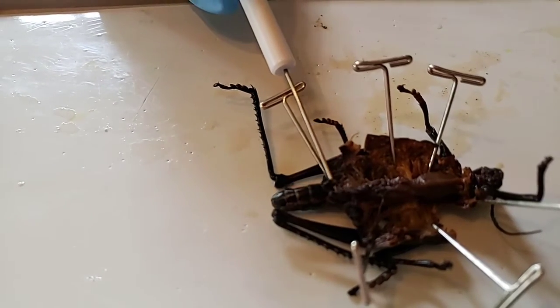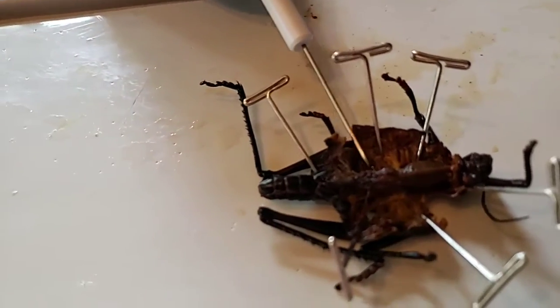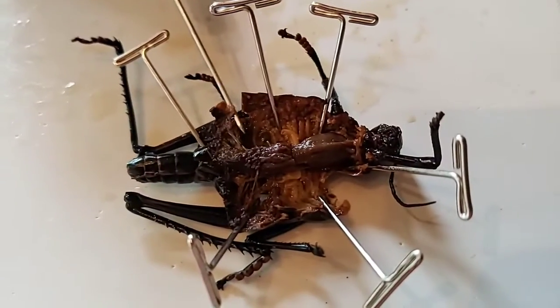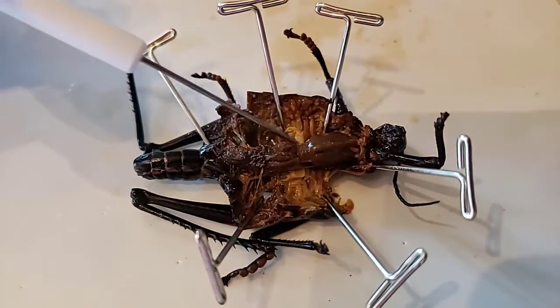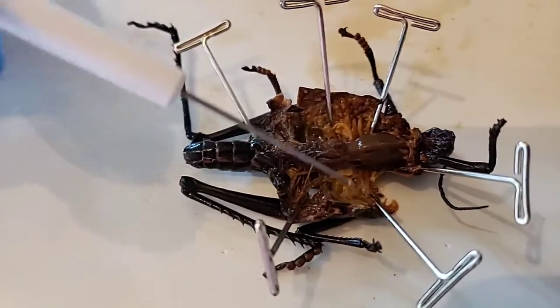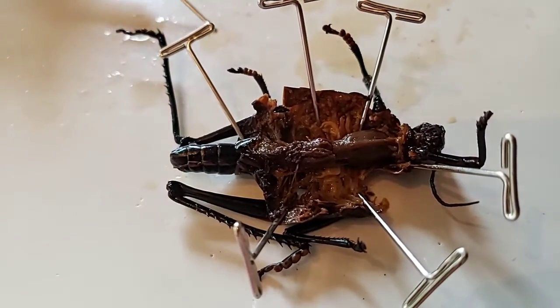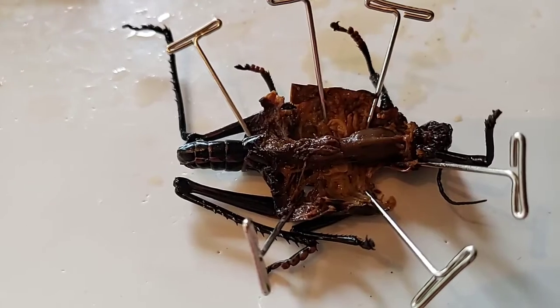You're going to see some yellow fatty tissue. Mine has a lot of yellow. For the most part, it's a little bit of fat that covers the internal organs. You guys don't have much fatty tissue in here. Otherwise, you wouldn't be able to see the organs, okay?